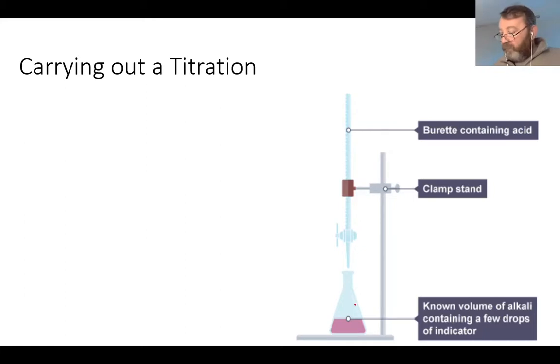Okay, so we've reached this stage now where you're ready to go. You know how to deal with your conical flask, you know how to deal with your burette, you know how to deal with your pipette, you know how to deal with any other piece of glassware that is involved in carrying out a titration. Okay, so we've reached the moment where we're going to do one.